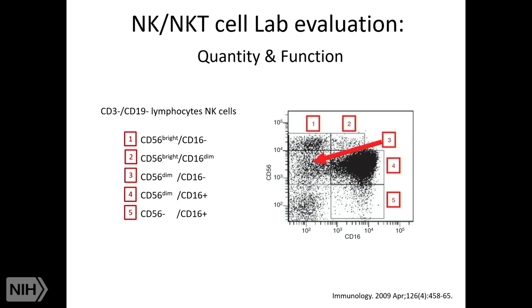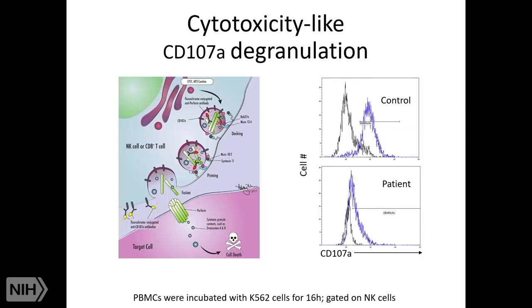And here you have multiple cells of NKs. So you have the ones that produce a lot of interferon gamma and the ones that are cytotoxic. There's one very interesting functional test that's called CD107A. CD107A is inside the cell. When you stimulate the cells and use an antibody without permeabilizing the cells, you cannot detect CD107A. But whenever you stimulate the cells and those granules open up, then you're able to detect them.